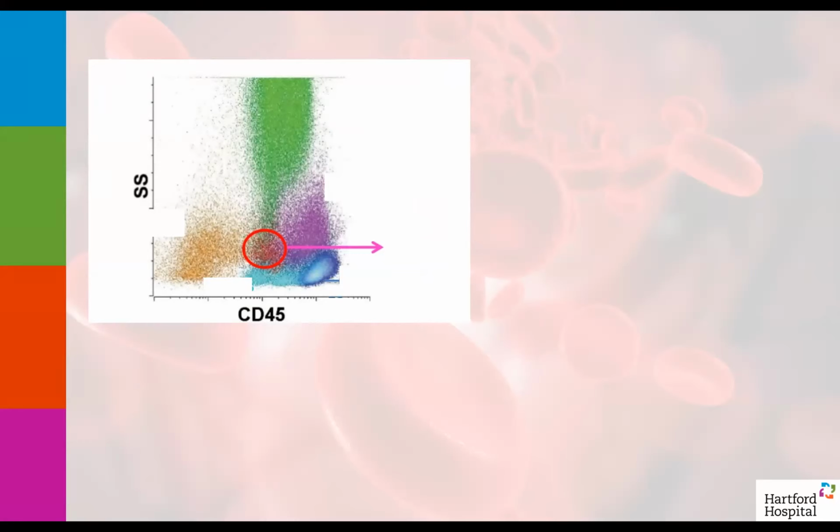There are some questions in the chat, Rajeshri, if you want to answer. Yeah, I'm responding to Junaida now. Yeah, you can answer. The question is if we add 7-AAD to all tubes. No, that's a separate tube. We just add 7-AAD and CD45 in that tube, and that is done before you set up anything else. Yes, that is correct. It is in a viability tube, Halima. So we run that, and if we do not see enough viable cells, we don't do anything else. We just say inadequate specimen and stop there. It is done in a separate tube.